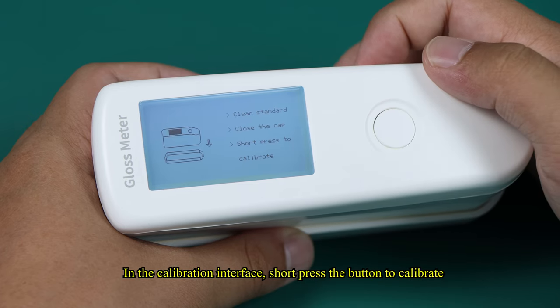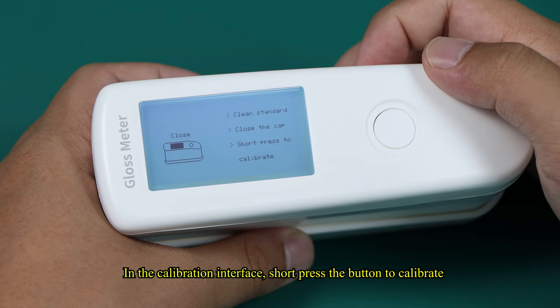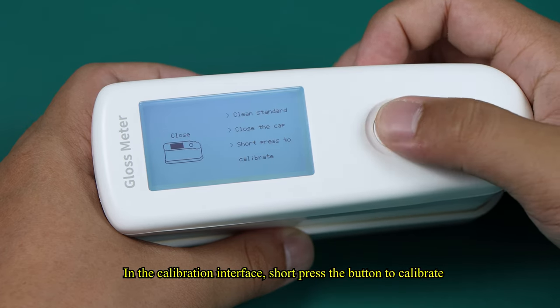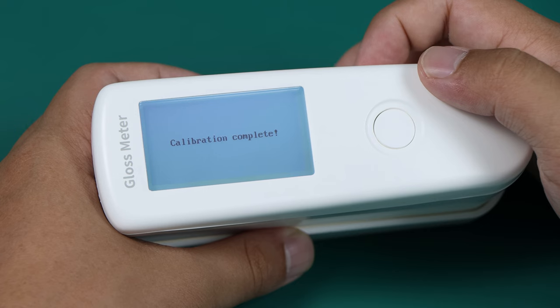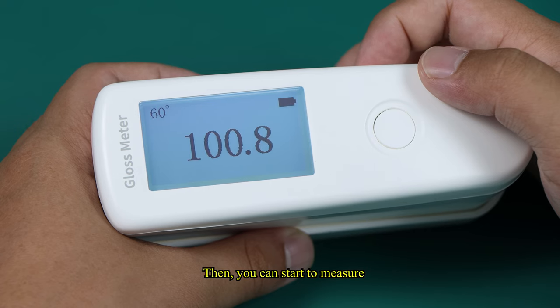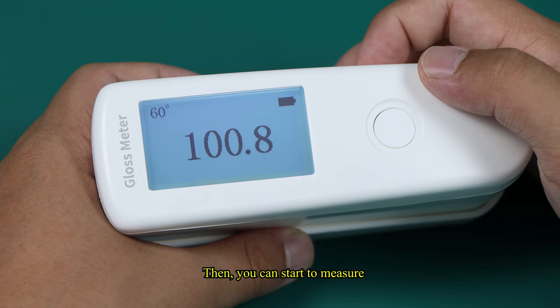In the calibration interface, short-press the button to calibrate. Then, you can start to measure.